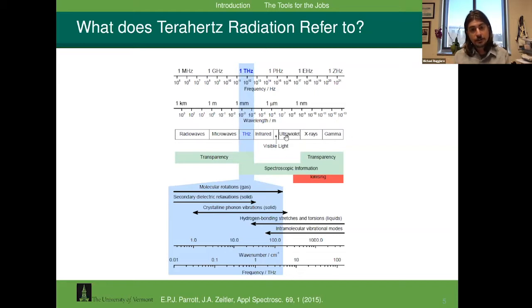On the higher energy side, we typically use semiconductors to generate visible light. For example, LEDs, light emitting diodes, are a semiconductor. We have lots and lots of experience, again, as a human race at making these semiconductors. The problem is that when we try to make an LED that operates at terahertz frequencies, it's too low in energy, and so it doesn't work. And so that's why there was a gap on both sides.